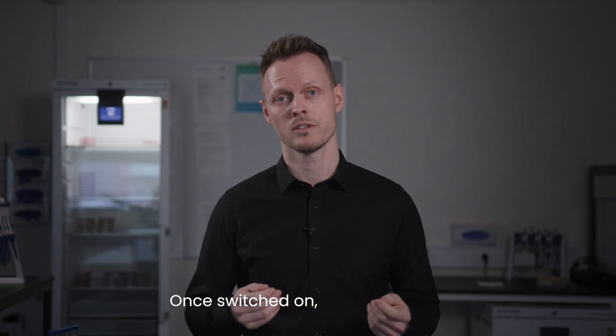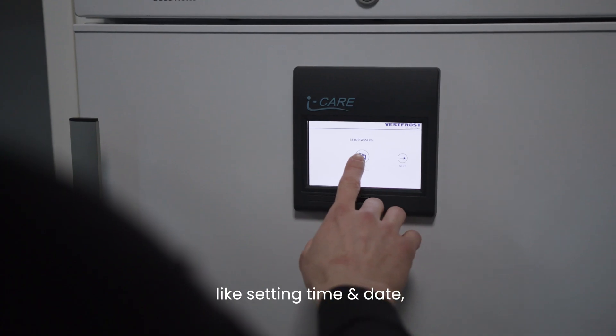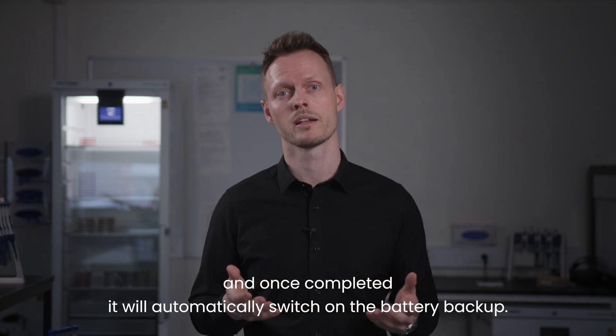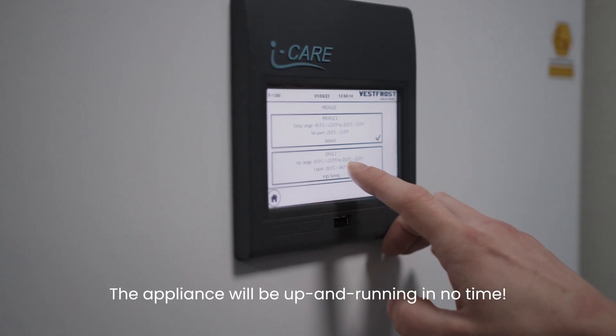Once switched on, an installation wizard will guide you through the initial setup, like setting the time and date, language, choosing a cooling profile, and once completed it will automatically switch on the battery backup. The appliance will be up and running in no time.